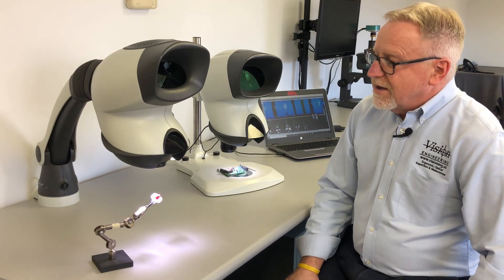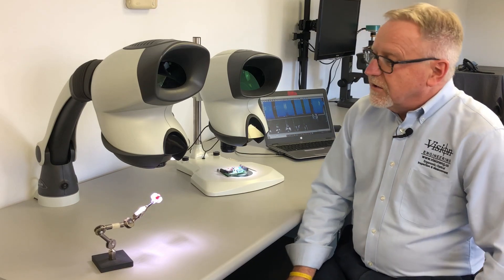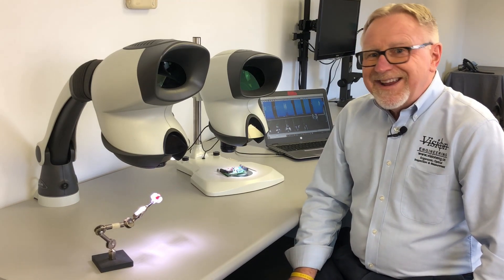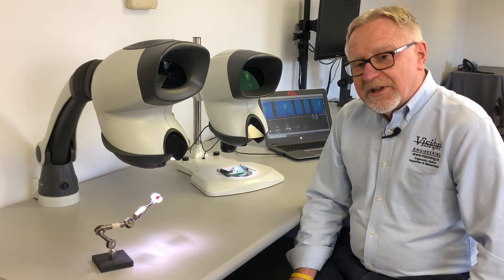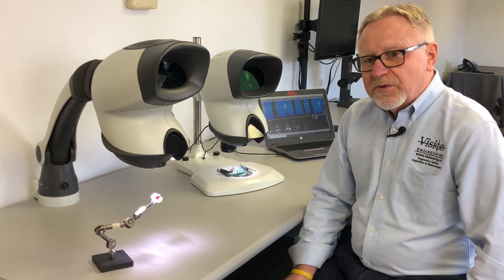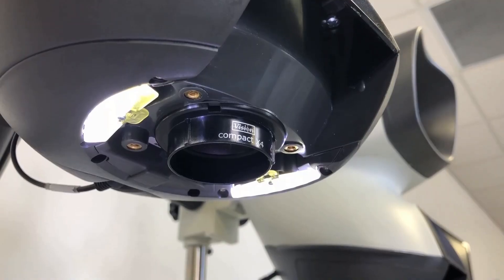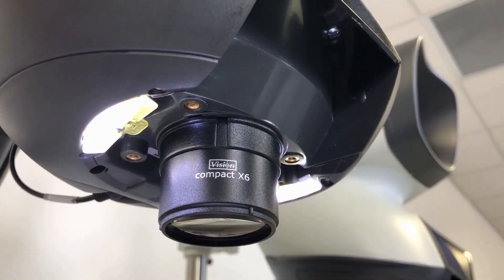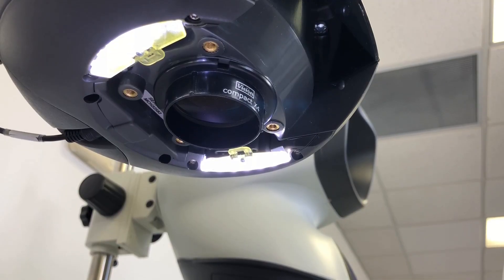The Mantis Compact is the baby of the family. It's a low-power viewer working with a range of two times to eight times. There are four individual lenses available in increments of two — two, four, six, or eight times magnification — and these lenses are easily changed on the fly. The system incorporates built-in LED lighting for white shadow-free illumination.